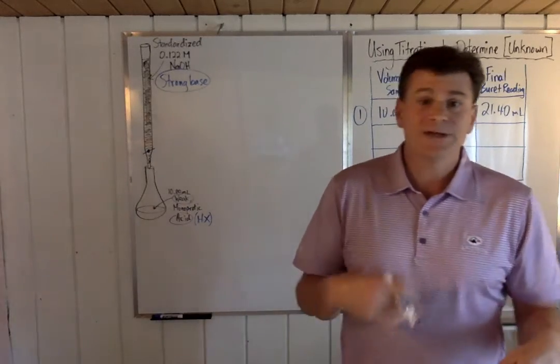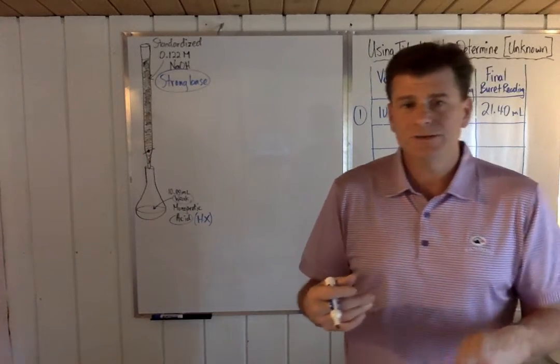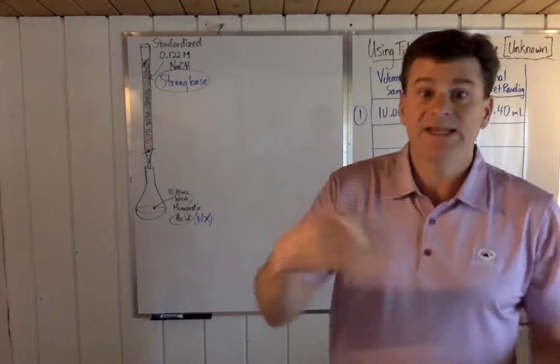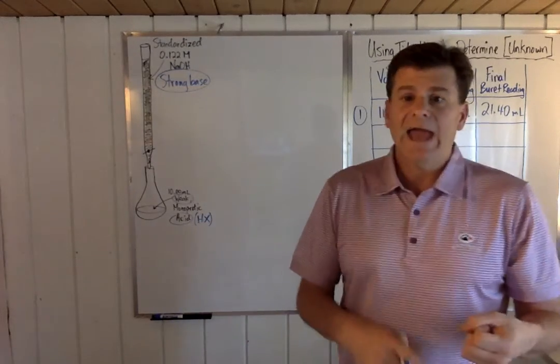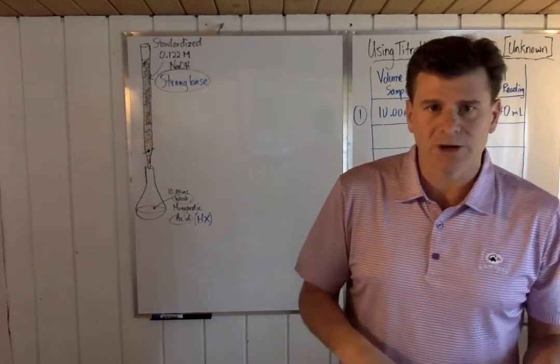But some teachers will say, no, you have to have three good trials. I know that for my experiments with titration, when I do the standardization, I make sure there's three good trials. Then, for a regular titration, I say two good trials. And if we're very limited on how much stuff we have, or I know it's going to take you a really long time, I'd say just do one trial.